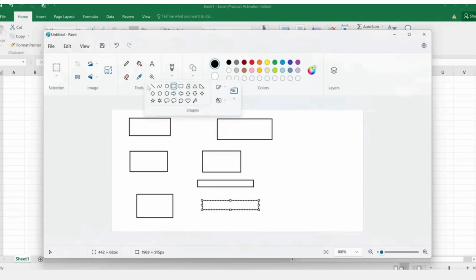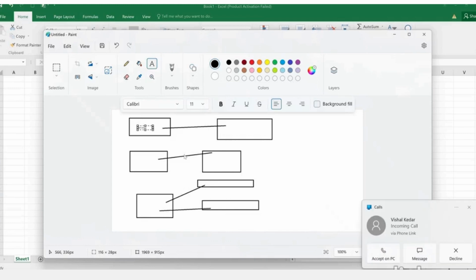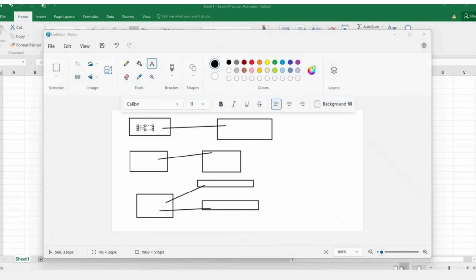Now here I'll show you. This is set value on DUC, and this is my standard, which is a variable.